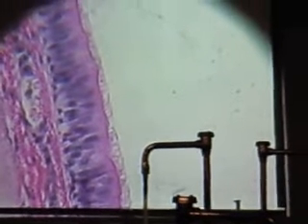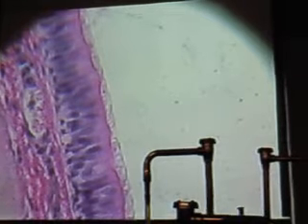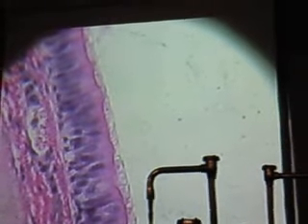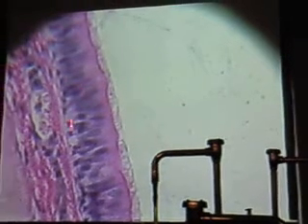What organ? Well, what can you see out here? Cilia. Okay. What's the cell type? Columnar. Are you sure? Cell arrangement. Oh, it's pseudostratified. Nuclei are all over the place.